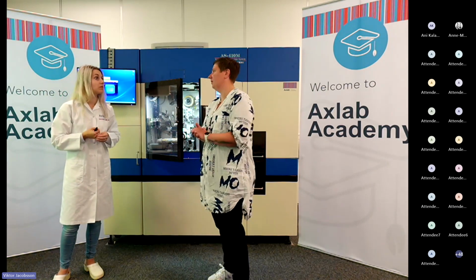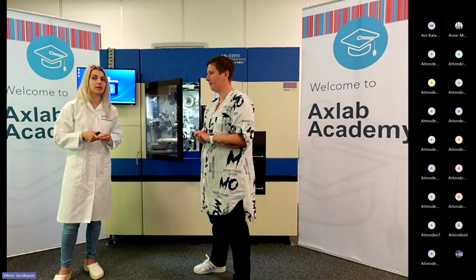So it's actually a conflict between looking at the one coming from the AS and thinking, could I even do this better myself? Exactly. And maybe in most cases you won't be able to. So that's the balance. Yeah, and the time consumption of it also, because when you have difficult blocks to cut manually, you also use a lot more time to section. Yeah. Next question, please.